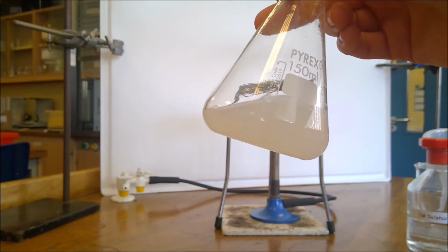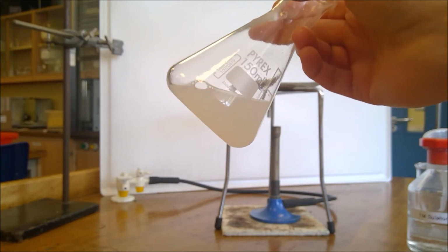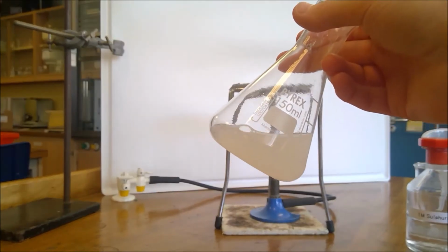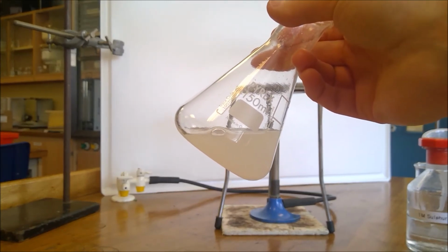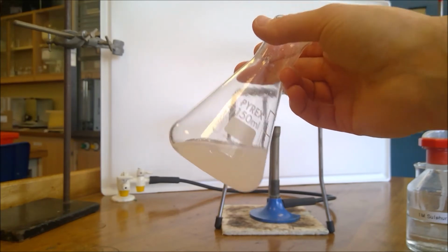What we now need to do is separate this out. So we have got an insoluble solid and a solution. So have a think about a good separating technique for separating these. So hopefully you've thought about filtration there.